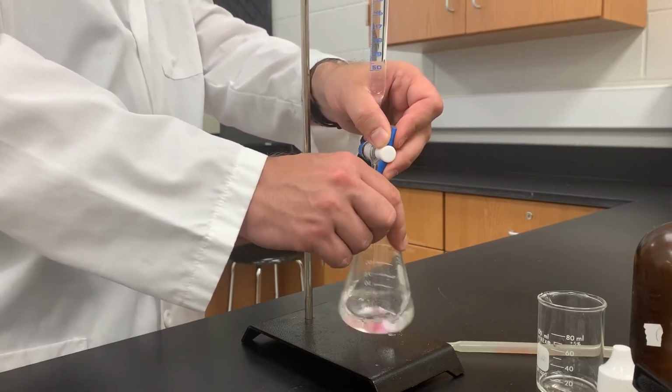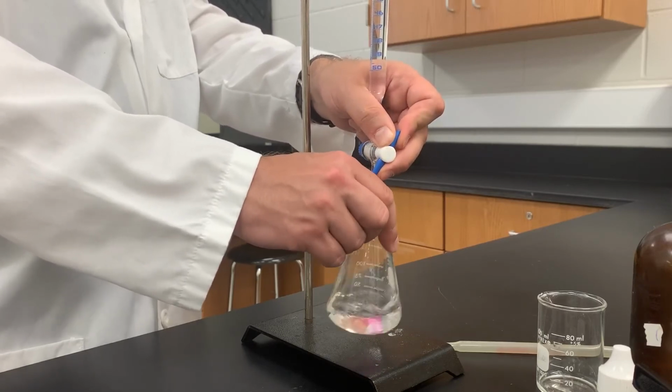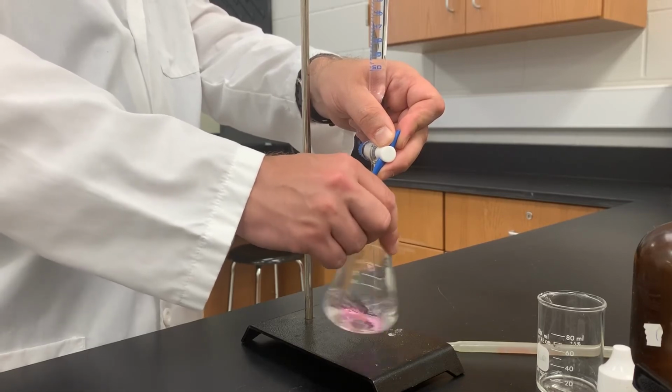You can start to see a little bit of a pink color that's staying around, so I'll slow things down a little bit until the pink becomes more persistent.